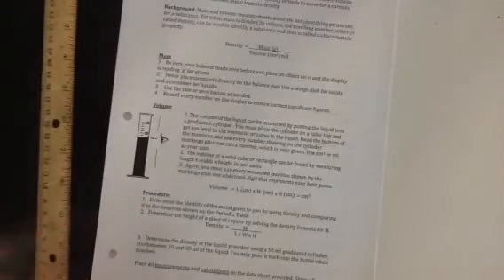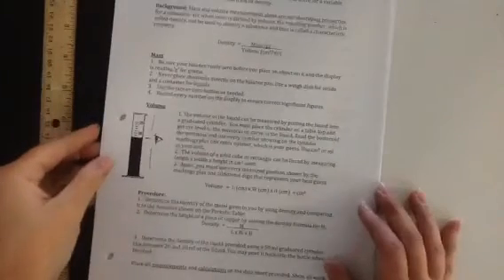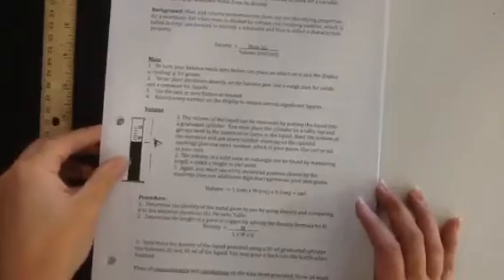Note to self, all of the metals in column 1 are called the alkali metals, and the alkali metals are explosive to air. So do you think that any of the metals I'm giving you are alkali metals? No. Right, no. So I love you that much, which is why I did not give them to you. So if you're finding like, hey, we've got sodium, no, you don't. So the first one you're going to do, you're going to figure out what metal you have.